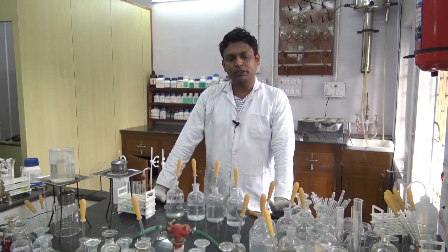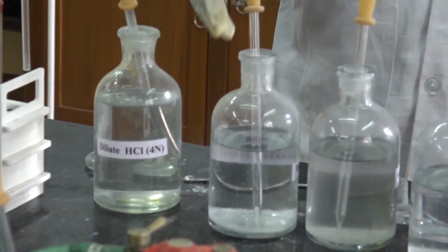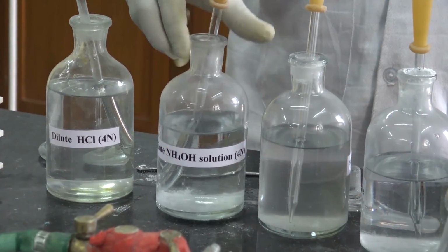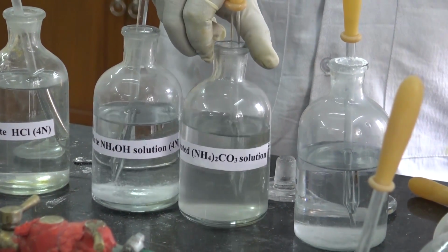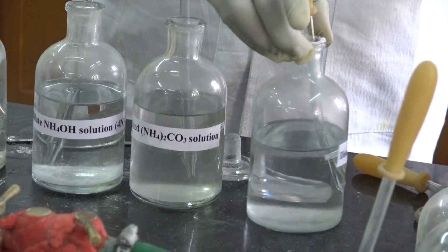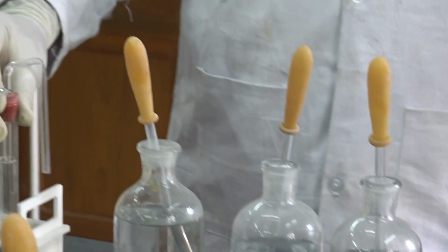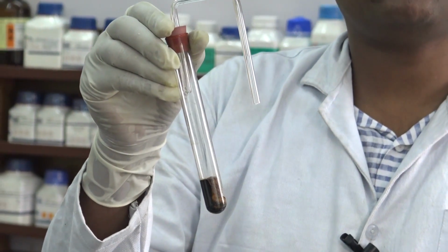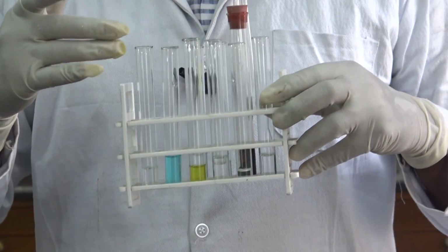For this group test, we need dilute HCl, ammonium hydroxide solution, saturated ammonium carbonate solution, disodium hydrogen phosphate, and H2S gas.